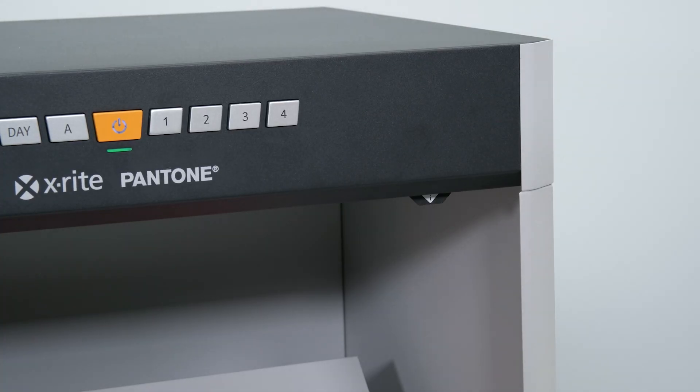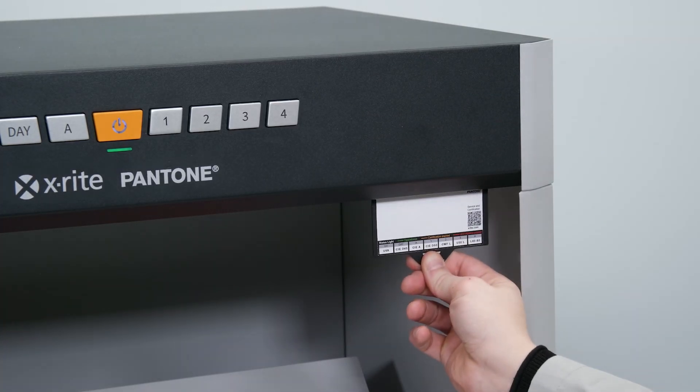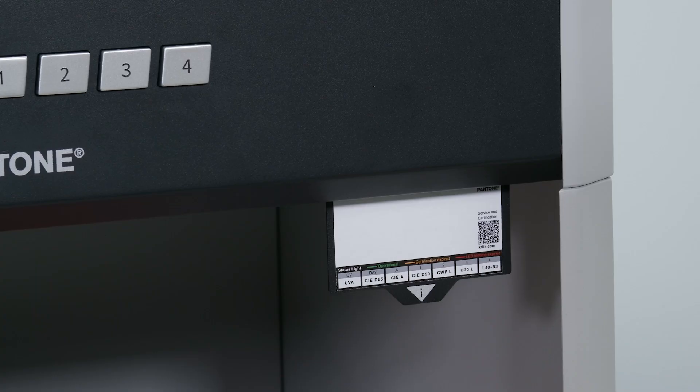Pull down the drawer located in the top right corner of the light booth to identify which illuminant is enabled in each position.